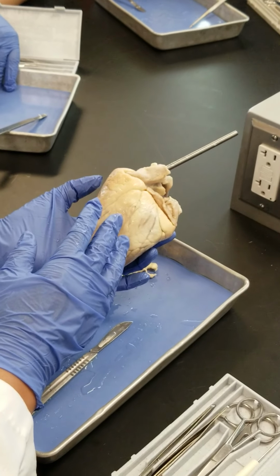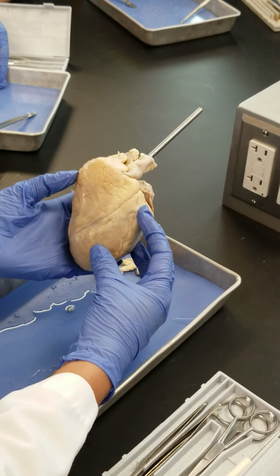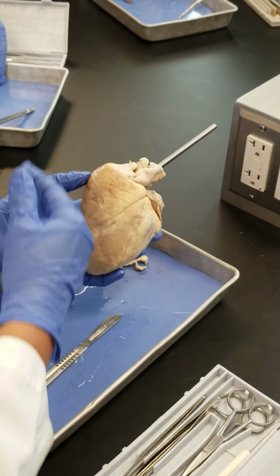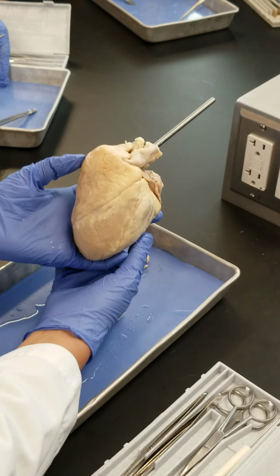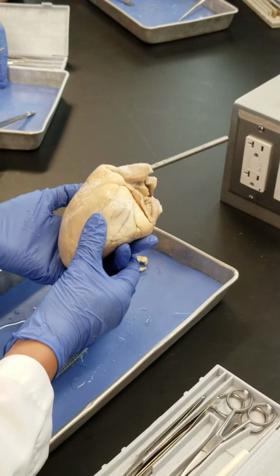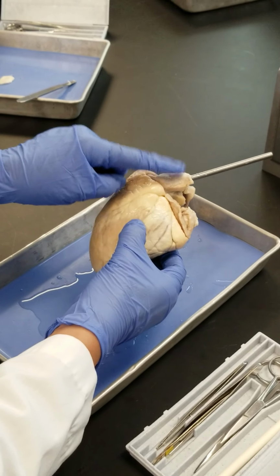This is slightly different from the human heart. You remember, in the human heart is slightly located like this in the body. So most of the anterior is mostly right ventricle, and from the left ventricle, you see only a bit of that. The rest of that is on the posterior. But you see, the sheep heart is a little bit different, but still it has all the parts similar, right? So that is the right ventricle, and this vessel is coming out of that.